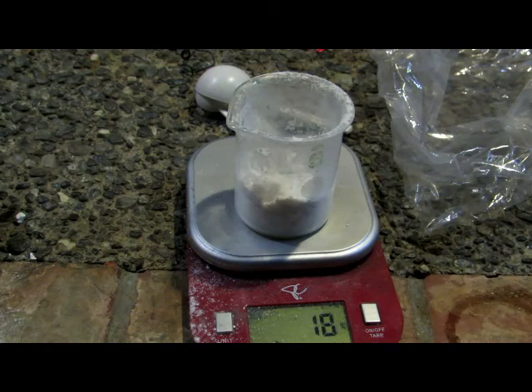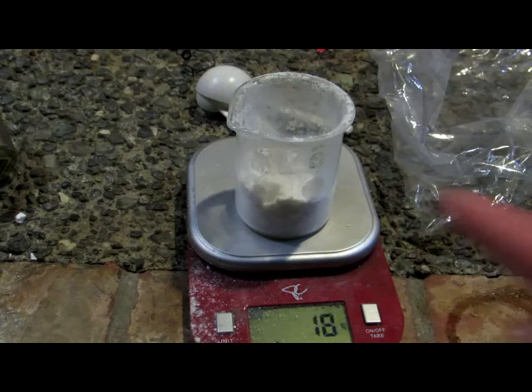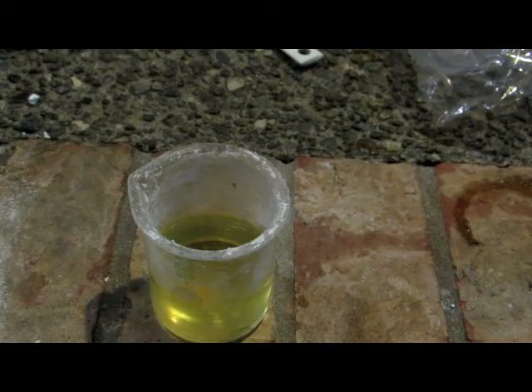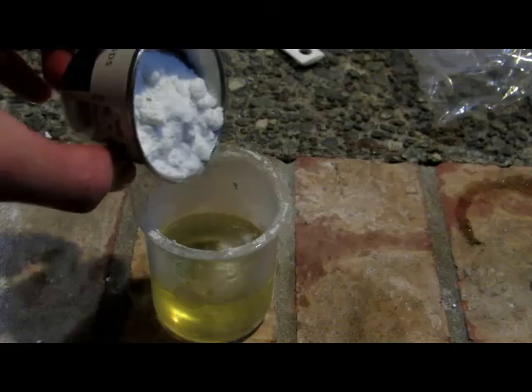Taking 18 grams and multiplying by 2.5 gives us 45, so 45 milliliters of hydrogen peroxide is what we need. I'm going to pour the lithium hydroxide into a condiment cup, then measure out 45 milliliters of concentrated 35% hydrogen peroxide into this beaker. Be extremely cautious when using 35% hydrogen peroxide, as it will easily and rapidly dissolve your skin.